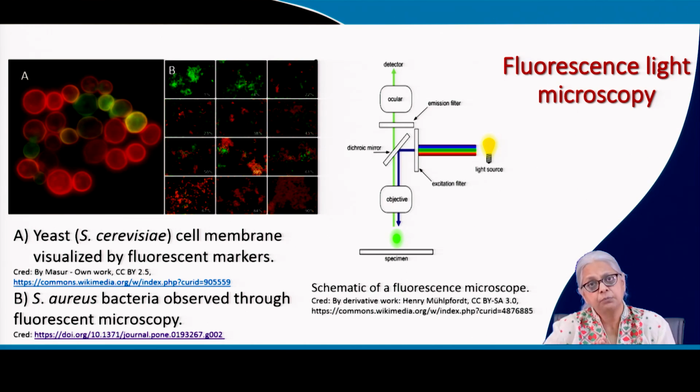Now, if the cell membrane is intact, it means the cell is likely to be alive and viable and capable of reproducing. On the other hand, if the cell membrane has been damaged, then the reaction to the fluorescent dye is going to be different.